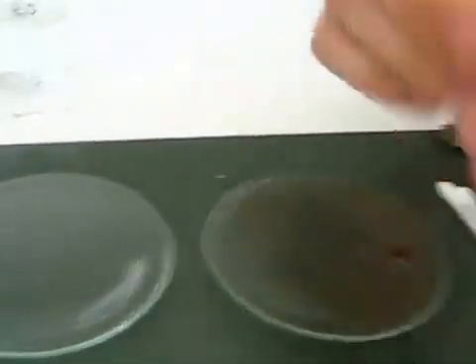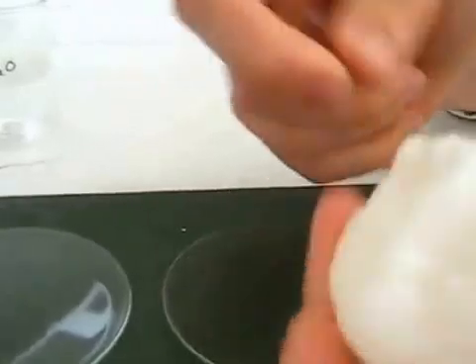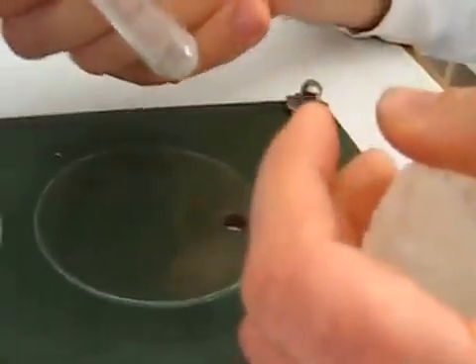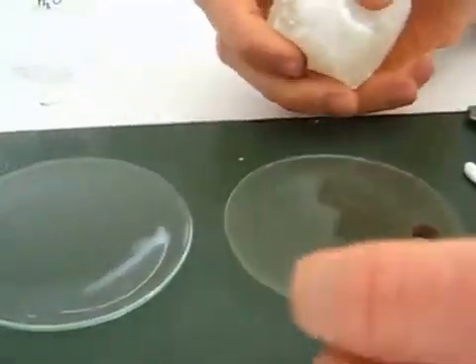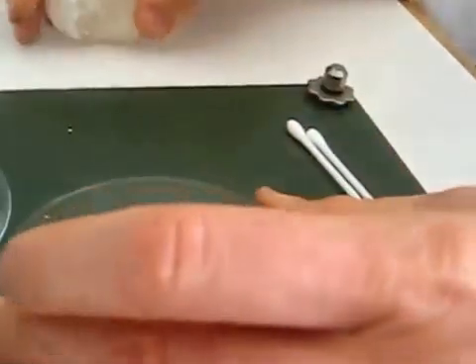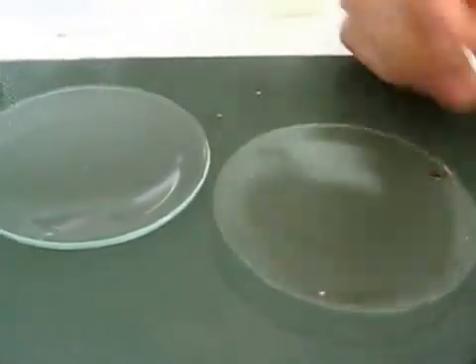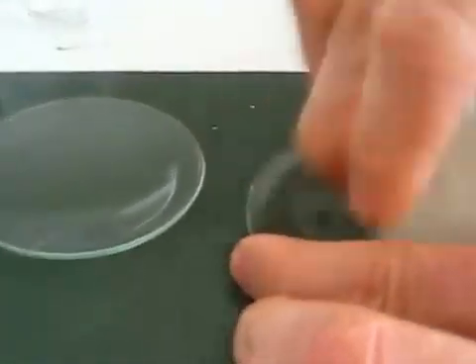Okay, so one option that we can use is take a test tube and drop some flakes of wax into the test tube and see how it dissolves. However, today we're going to use a slightly different method using these cover glasses and Q-tips, and we're going to rub the wax onto a clean piece of glass here.